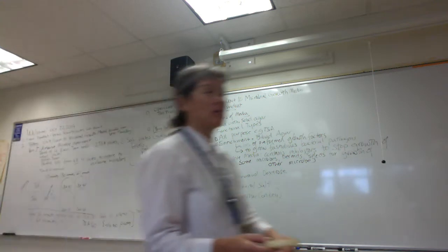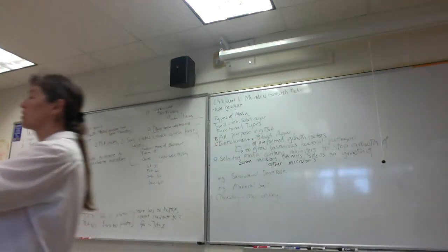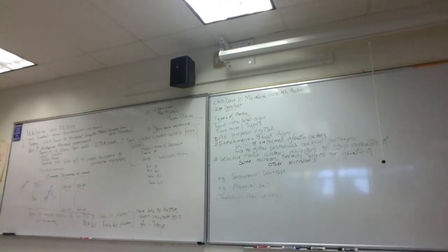And it's really helpful, folks, because as an example, today when I was taking the TSA plates out of their sleeves, they were supposed to be sterile, but I found this one. How do I know this one was not sterile? Yeah, see, we have, oops, it's dripping down on my sleeve. Okay, let me go take care of this. But we can see right off the bat that this plate wasn't sterile. So let me decontaminate myself here.